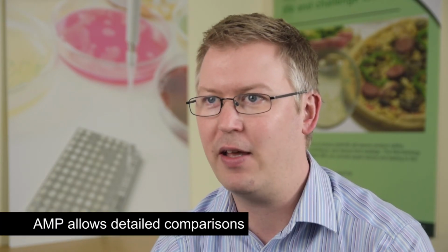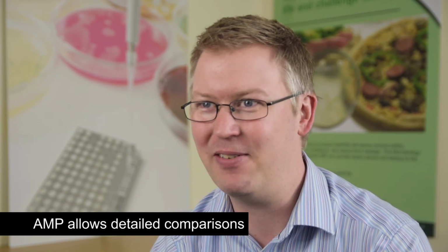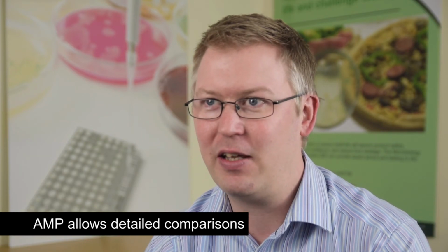AMP is a brilliant, powerful new technique, but it does not mean that you don't have to design a good experiment. Good experimental design is absolutely key with AMP, as it is with anything else. Companies need to think about what question it is that they want to answer with AMP. For example, a general survey of a microbial population is always useful. However, it is far more useful to do that survey targeted at comparing, say, a high care area versus a low care area of a factory.